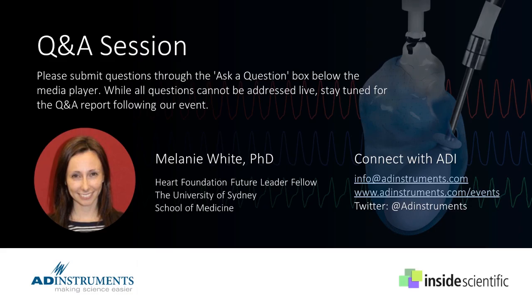So 3 minutes, if it's from euthanasia to perfusion, you're doing really well. If it's 3 minutes on something larger than a mouse, from incision into the diaphragm and hanging, it's starting to get a little bit long. And it just comes with practice. And keep in mind, as I showed in the video, that you can trim the excess tissue away from the heart once it is being perfused. That's always an option to reduce that time period significantly. Okay, great answer.